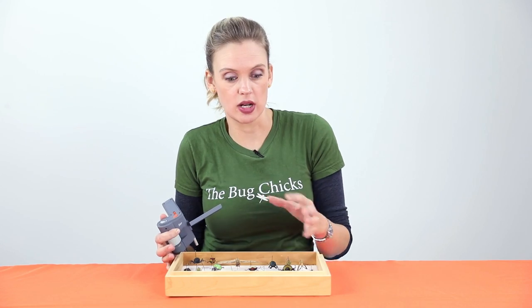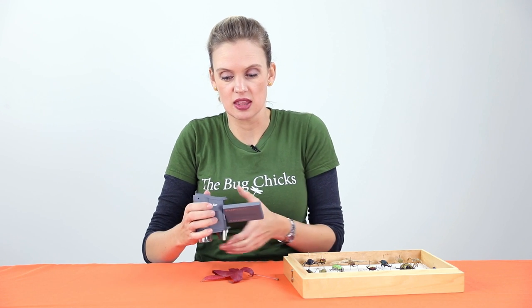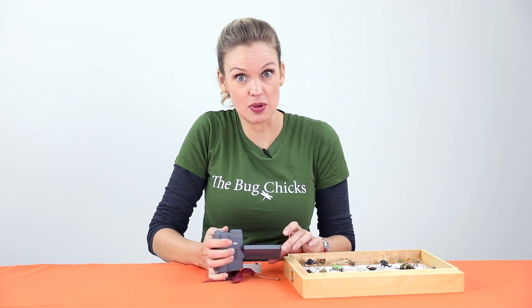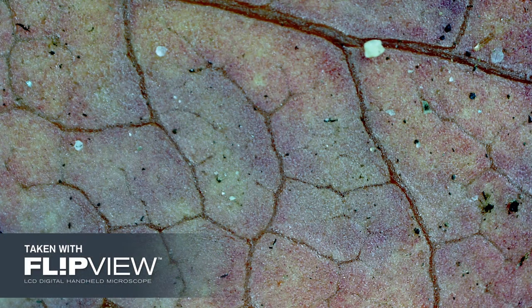I'm going to get these hairs on this beetle elytra. Now, if you want something that has a lower profile and you want to take a picture of it, I have a little trick. Here's a leaf. The FlipView has this great little kickstand, kind of like on a bike, so that it can rest against that kickstand and keep it very steady and get the veins on a leaf.